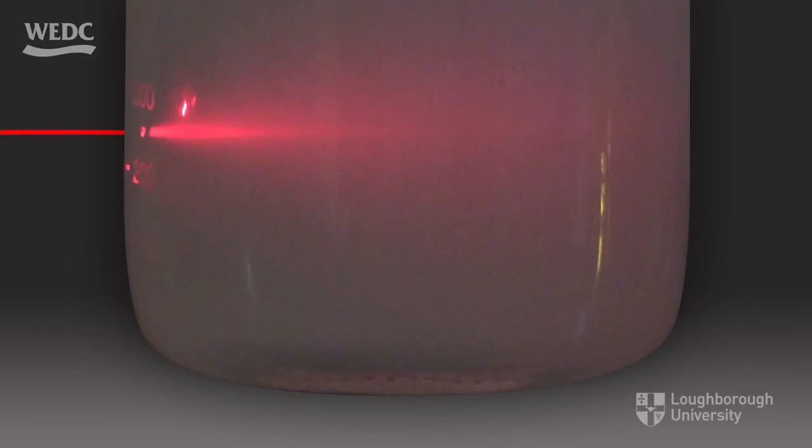If we look at milk in water, this is not a solution, it's a suspension. There are tiny globules of fat suspended in the water, so as we shine a light through it, we notice the light is scattered, confirming that it's a suspension and not a solution.